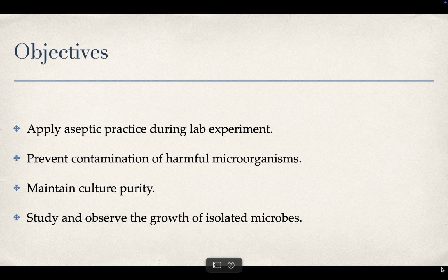Objectives of this lab were to apply aseptic practice during lab experiments, prevent contamination of harmful microorganisms to your samples, maintain the culture purity, and study and observe the growth of isolated microbes during your lab.